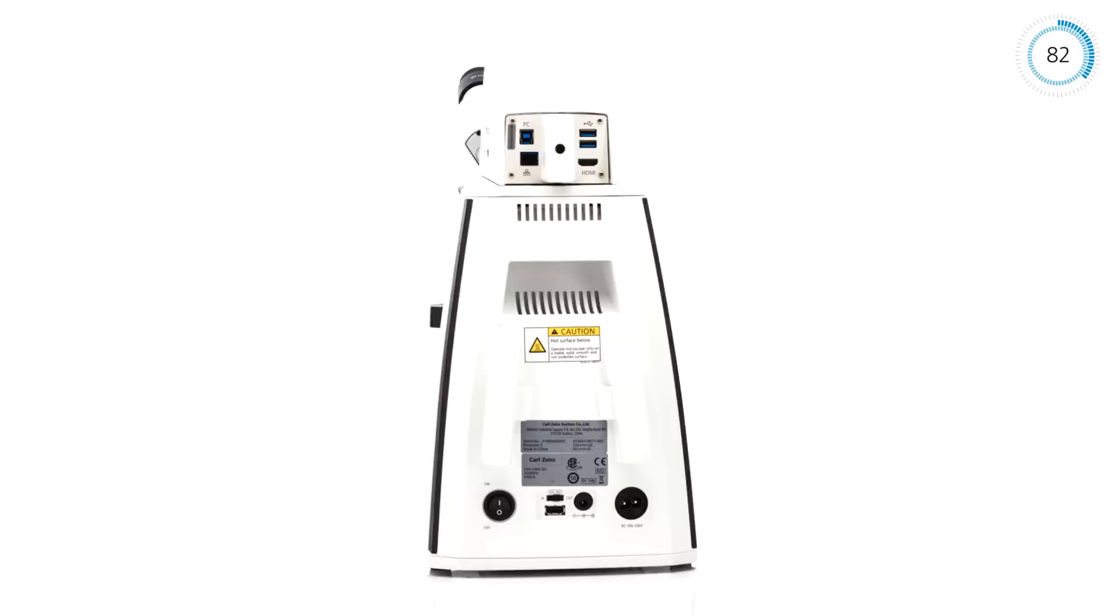So, tailor your microscope to your tasks and let your applications determine which accessories you need.